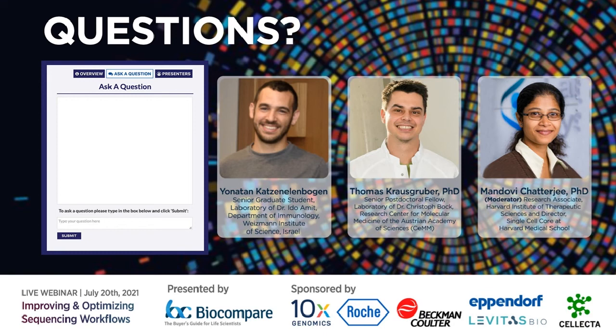So there is certainly a lot of value in bulk RNA sequencing as well, in certain conditions.